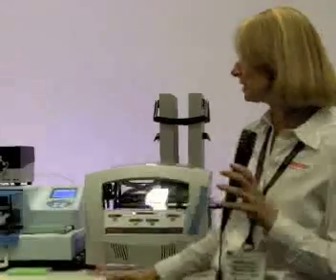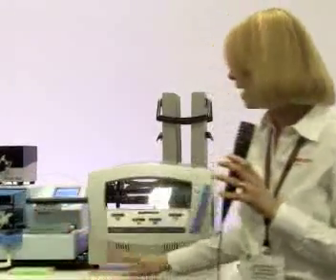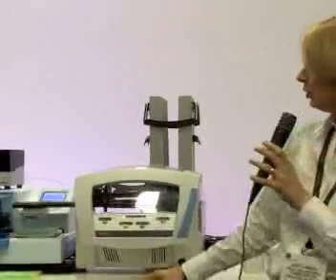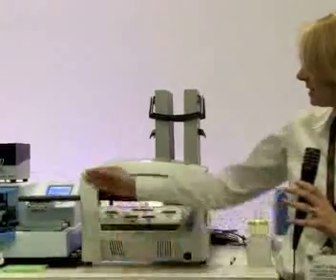This is a wonderful solution put together because what it does is it allows you to get the most out of your Multi-Drop by enabling it to dispense from two, four, or six, up to eight reagents. The RapidStack is the fastest, most flexible stacker on the market, and you can see it very quickly and easily delivers a plate to the Multi-Drop Kombi as it dispenses a variety of reagents.